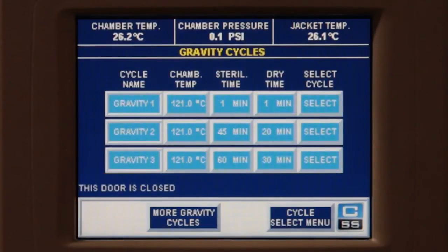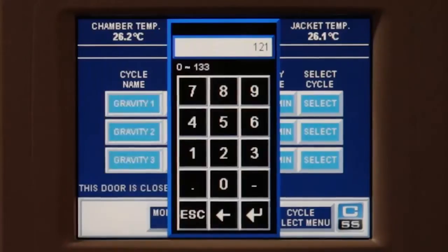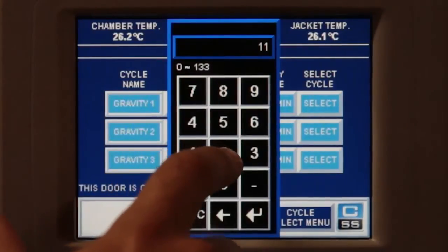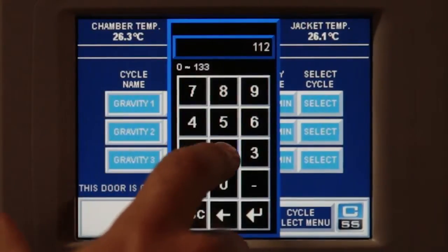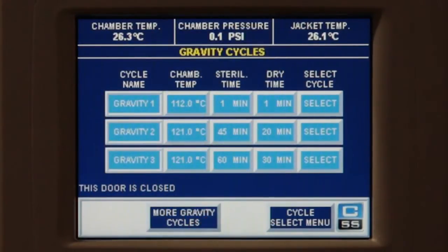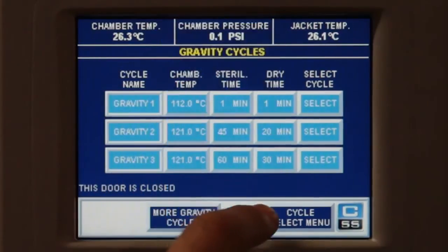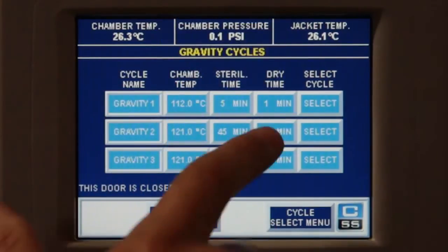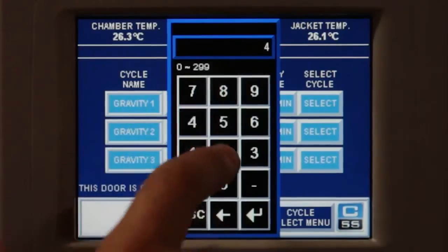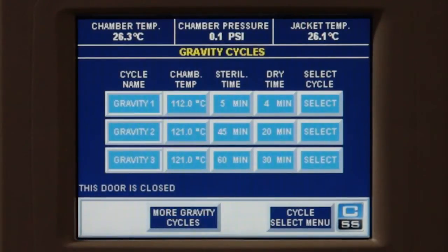Enter your chamber temperature parameter. Enter your sterilization time. Enter your dry time. Press select.